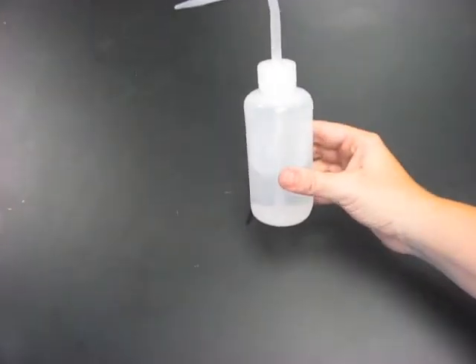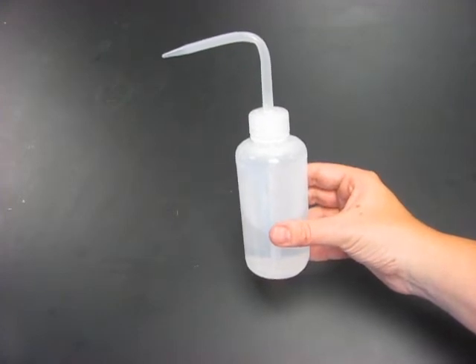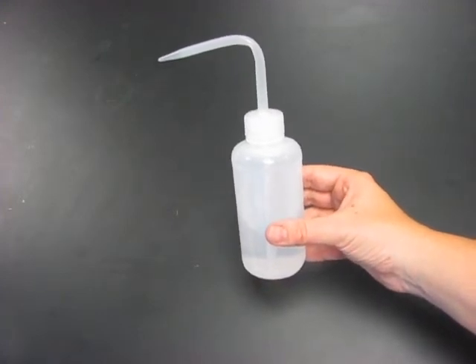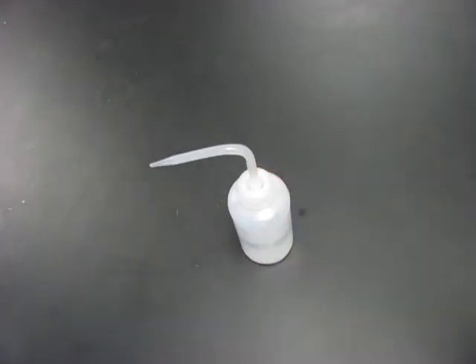Your wash bottle already contains distilled water. If your wash bottle runs out of water, please go to the fume hood, find the bottles labeled distilled water, and refill your wash bottle before you leave lab.